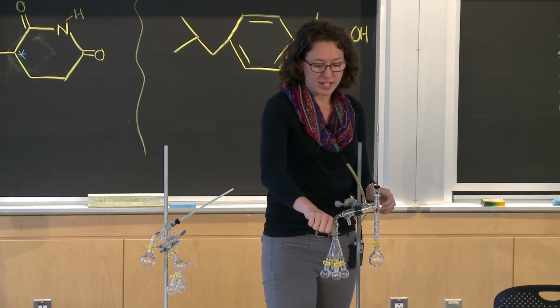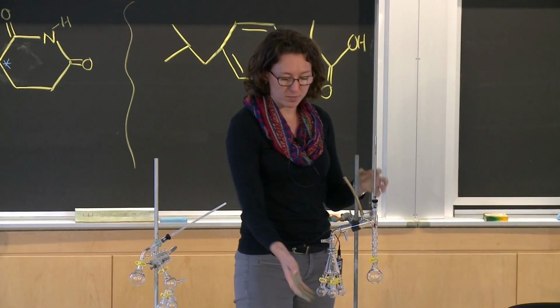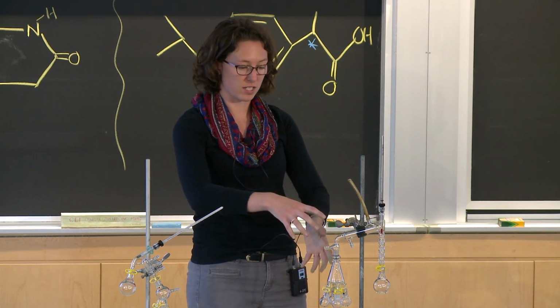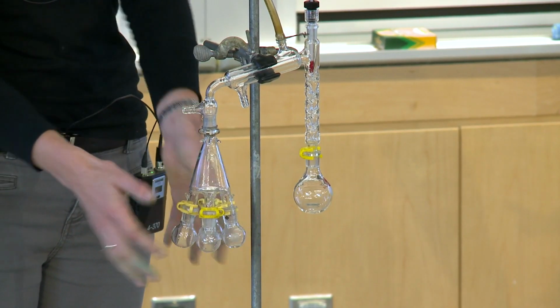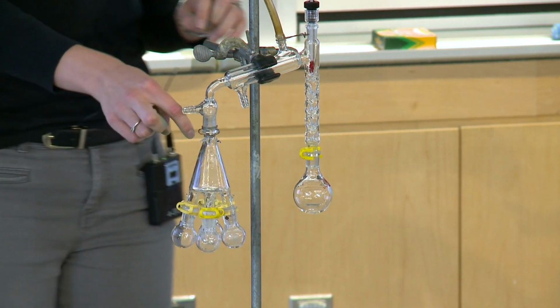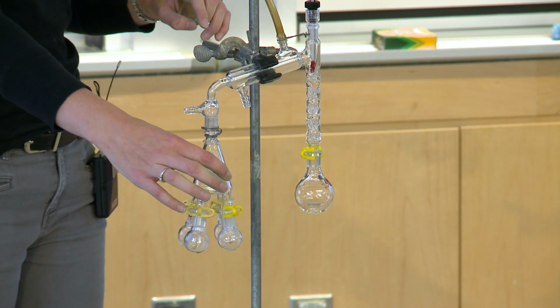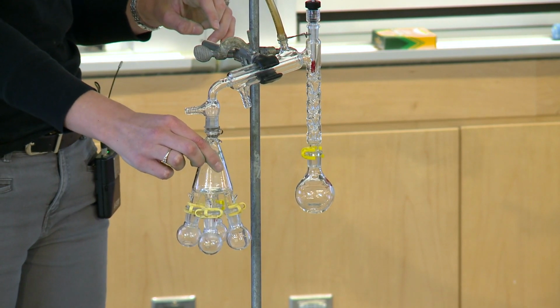So you will make sure that your vacuum line is connected here. You'll turn your vacuum on. And then we're going to make sure this whole system is under vacuum, and you want to be able to collect different fractions, so your things will boil at different temperatures, right? So you can't be swapping your collection vessel in and out if your whole system is under vacuum. So we use what's called a cow adapter. This is a cow thing because it looks like some cow udders. And you can attach 4 different flasks to the bottom of it. The ones that you'll see in lab will have a little spout here, so you can see which flask your spout is pointing towards when you are using it. So you can rotate this so that you'll collect your different fractions in different vials or in different flasks.